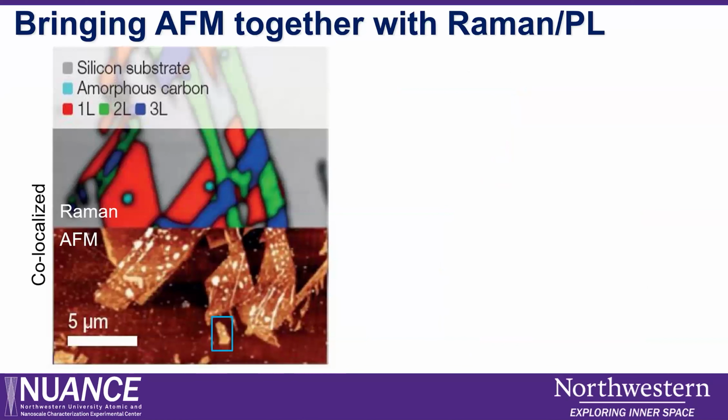Then I will touch quickly on the third system we have, which brings the AFM together with Raman and PL. Here you can also do high resolution chemical mapping, but there are limitations on the sample. It has to be a very thin layer of the sample. Nano-IR doesn't have that limitation, but this has a limitation.